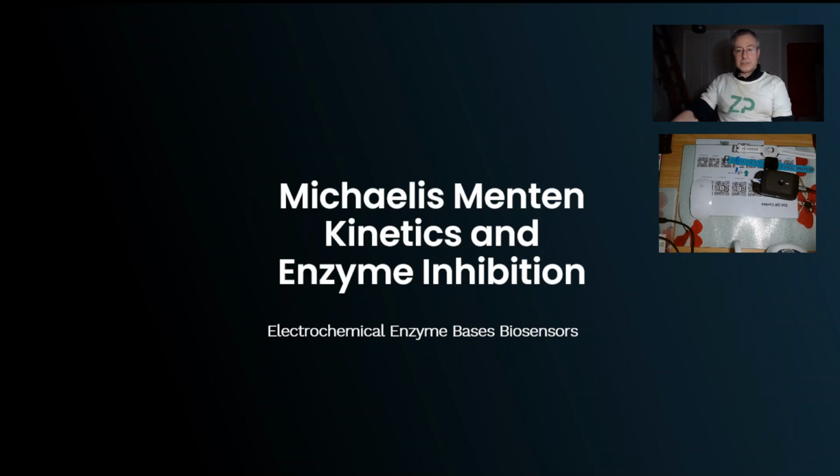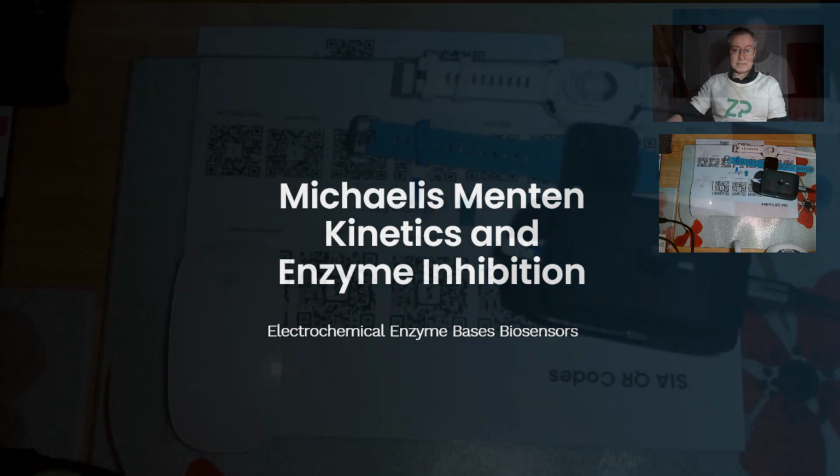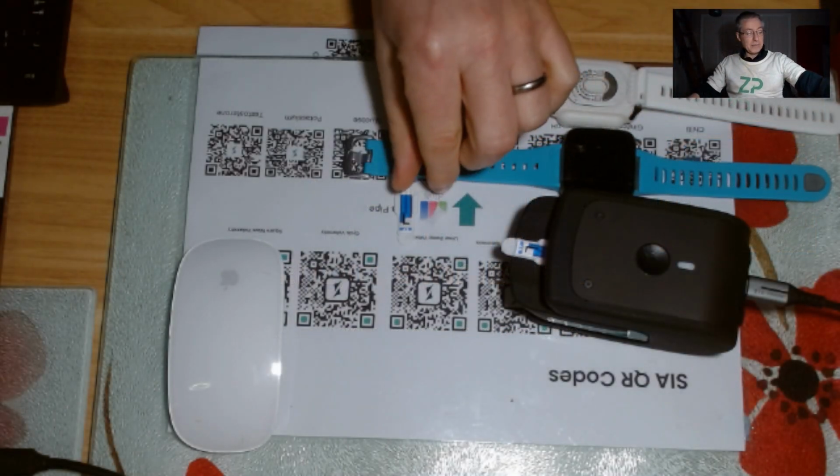Hi, welcome to this introduction to electrochemical biosensors, and specifically the impact of the Michaelis Menten kinetics and enzyme inhibition with respect to electrochemical biosensors. So when I say electrochemical biosensors, I've got a couple of examples in front of me.